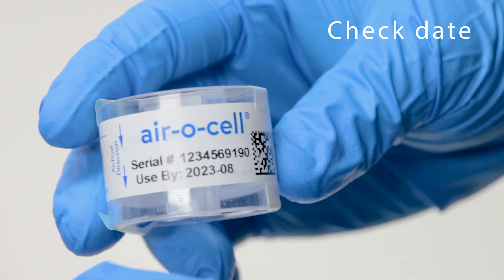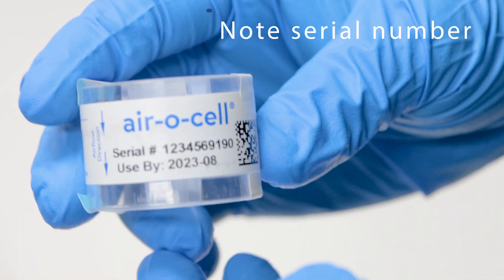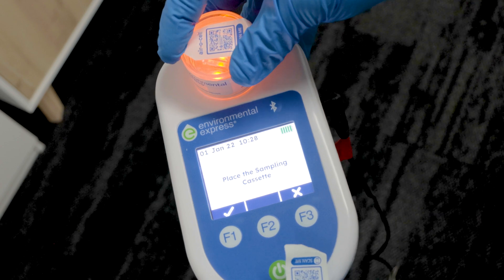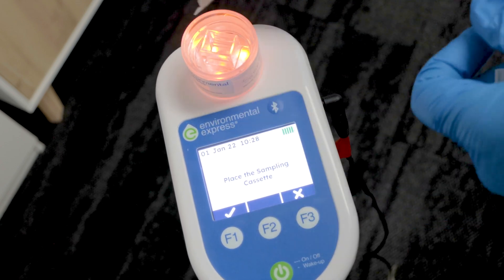When making a sample, first check to see if your cassette is in date. Note down the cassette serial on the chain of custody to keep track. Take the stickers off the cassette and place it onto the pump.